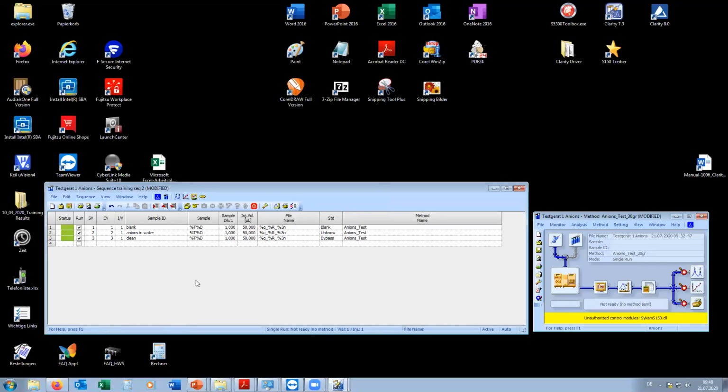Okay. Here there are two more things I did not talk about. This is easier, the run. I talk about this first. Only the checked lines will run. So if I click this, then the first line will not run in the sequence. So only those ones run which you click.